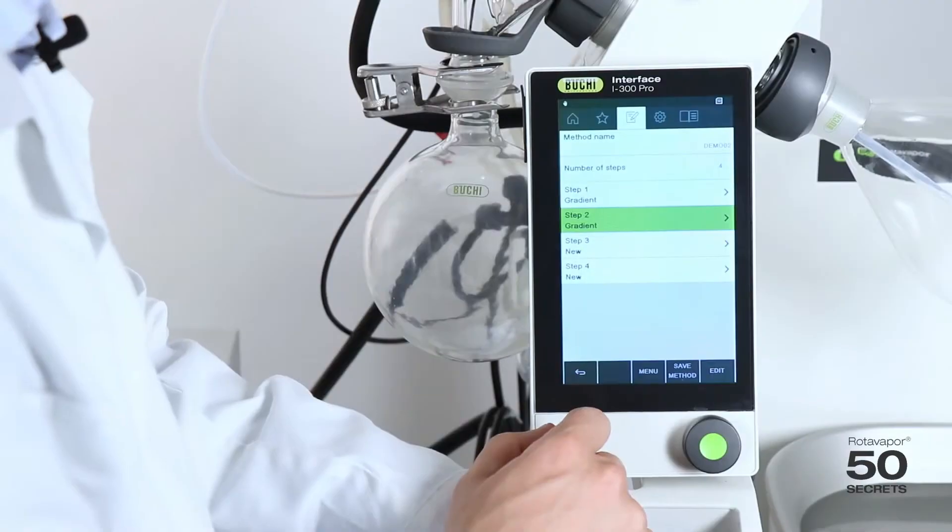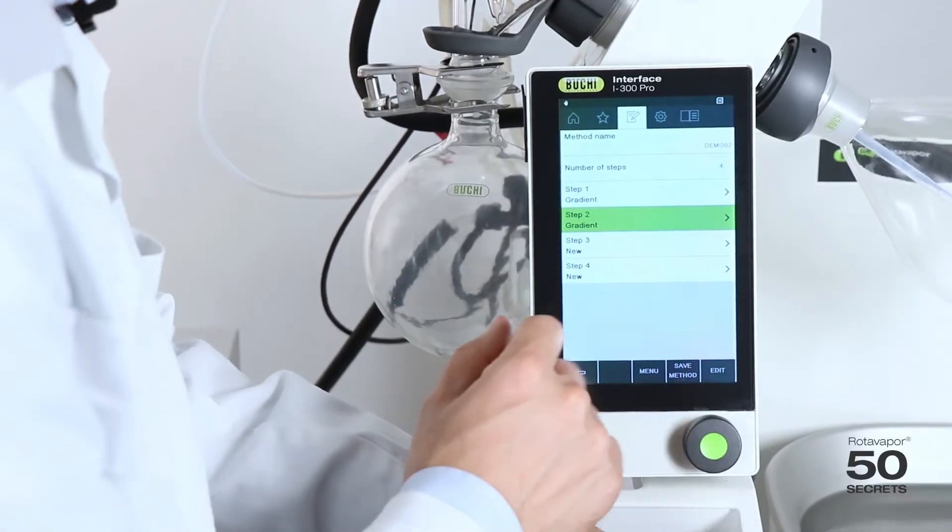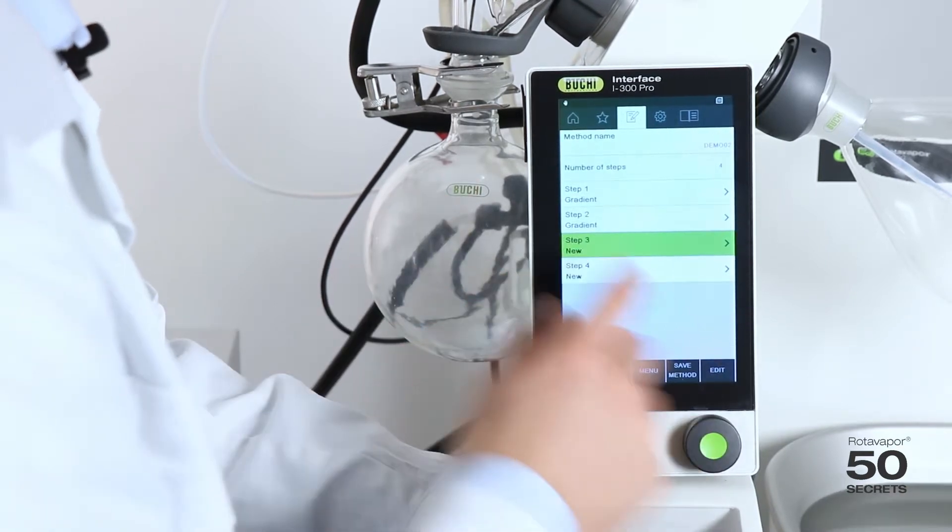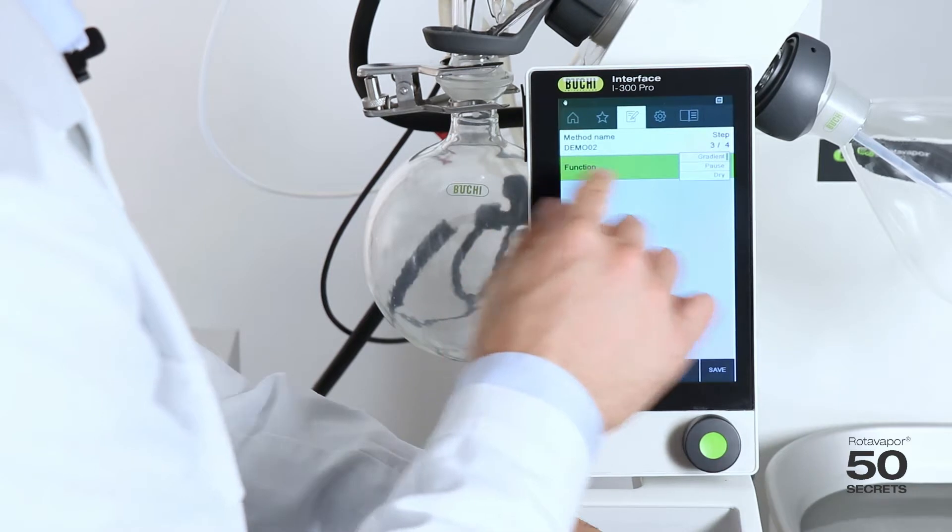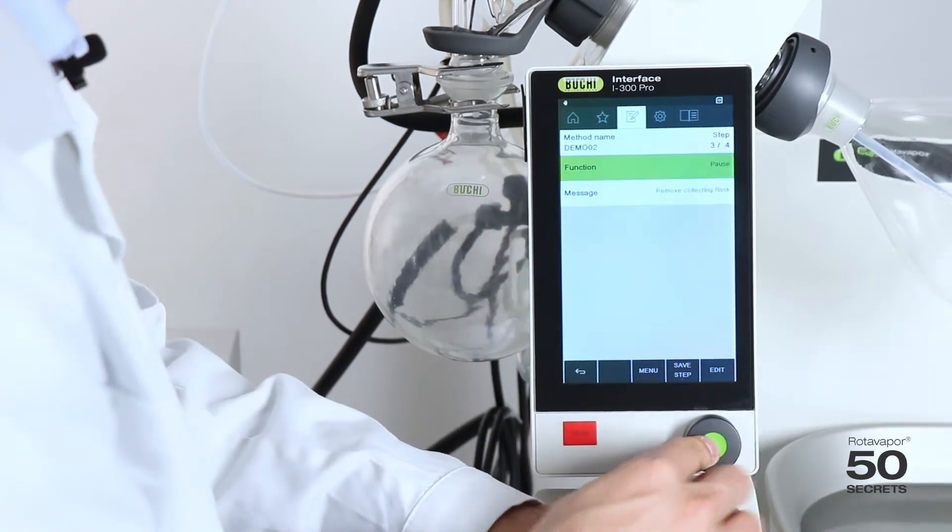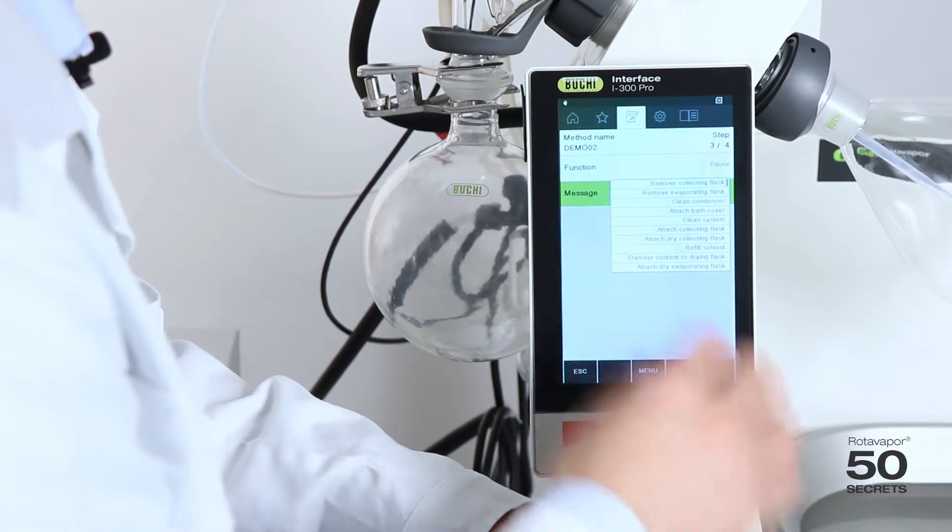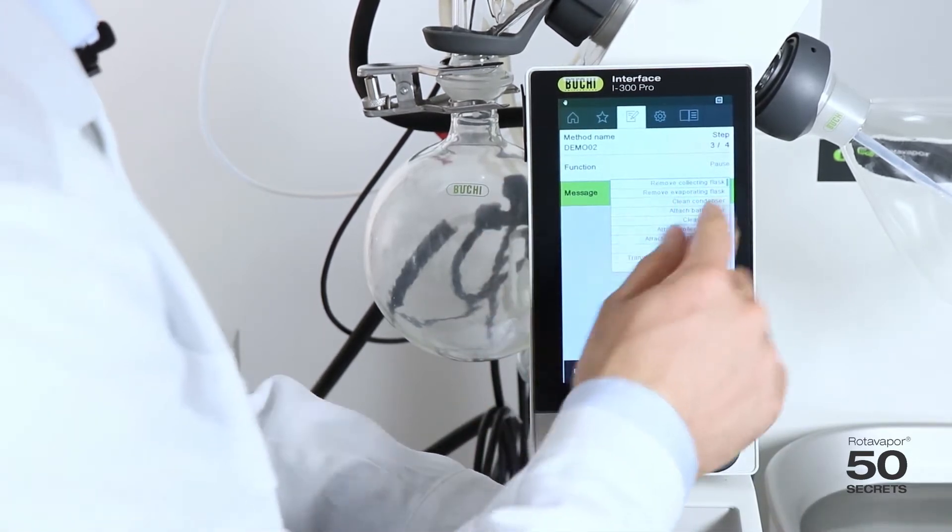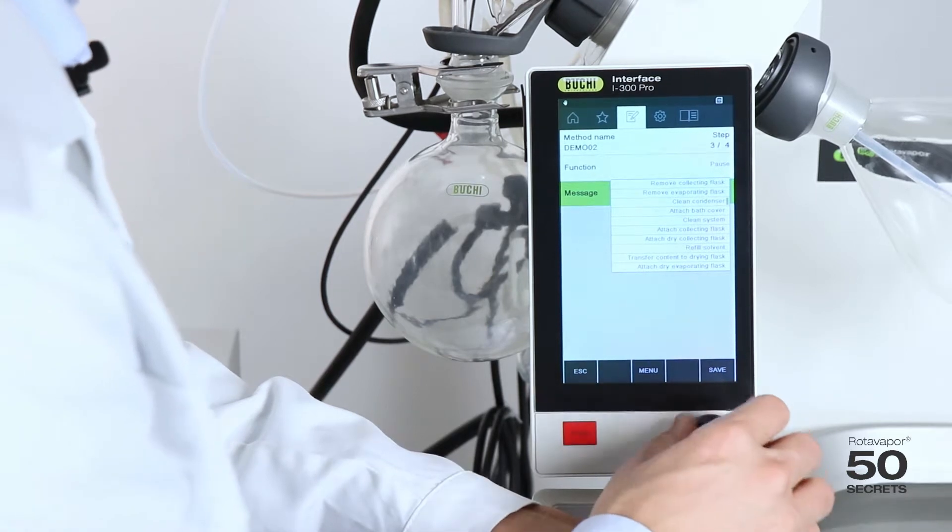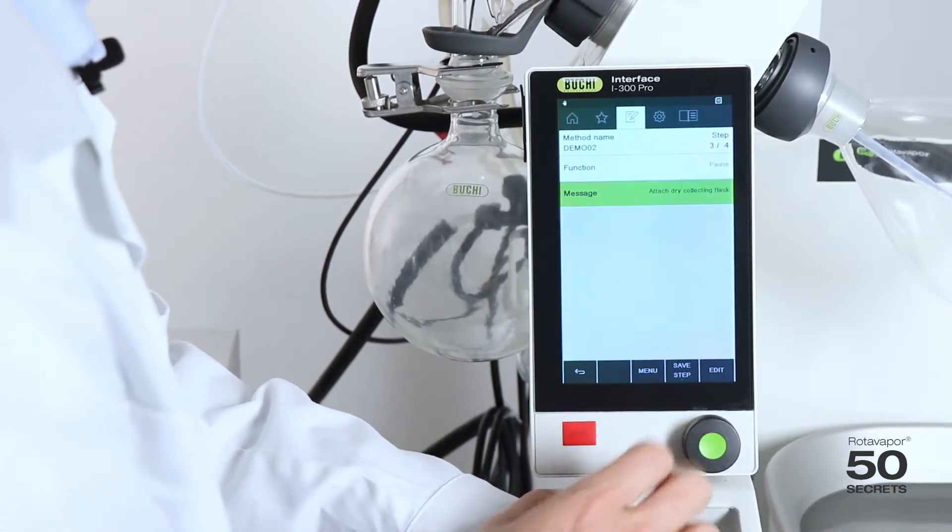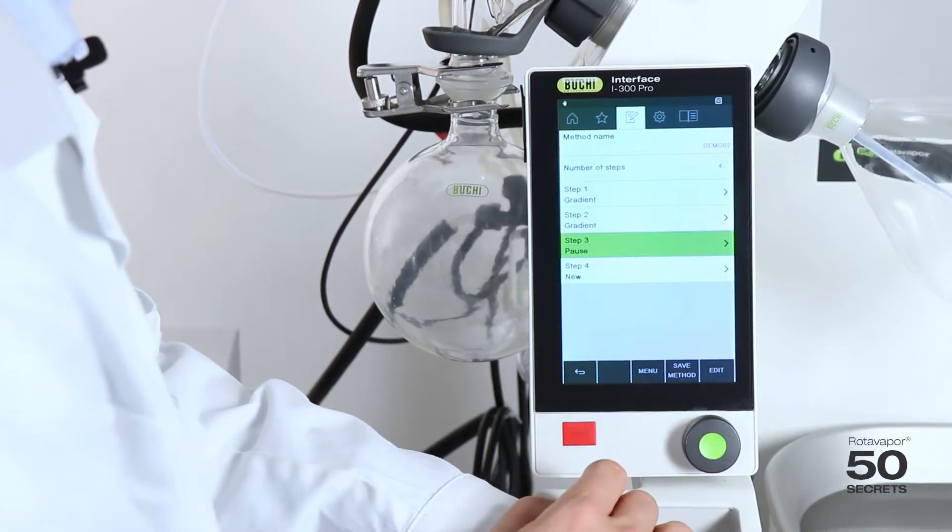The third step now is to replace the receiving flask. For that reason we choose the function pause. We can choose from a number of messages. For example, remove collecting flask, cleaning condenser or attach dry collecting flask. We choose that. We save the step.